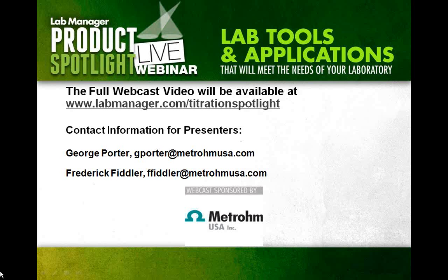And one key thing is that we would not use a very dilute titrant, and that adds an additional limitation as to how low we would go. But if there are follow-up questions that you have regarding a specific type of oil, please send over an email to us, and we'll follow up with you in terms of discussing your specific needs.